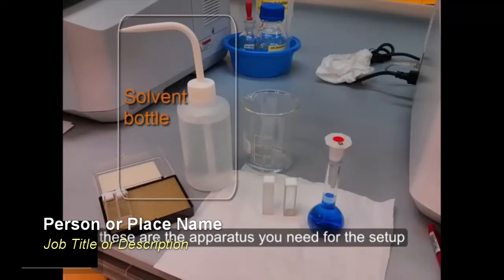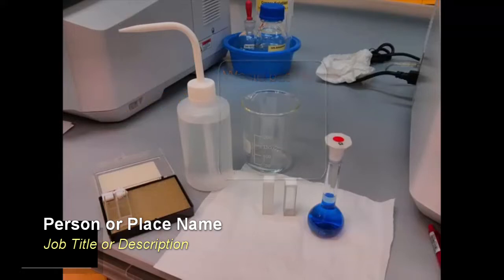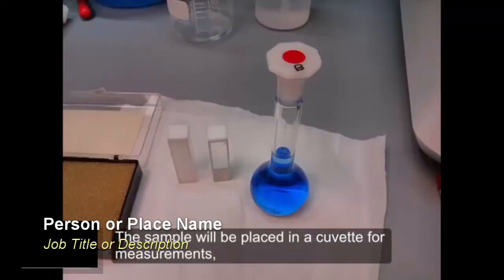A solvent bottle, a waste beaker, a pair of glass cuvettes, and a volumetric flask containing your solution. The sample will be placed in the cuvette for measurement.